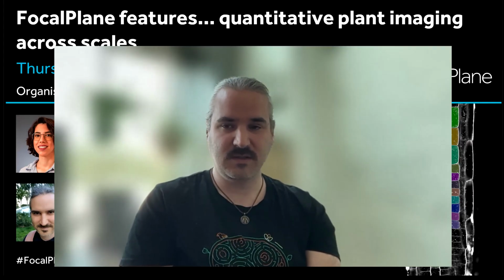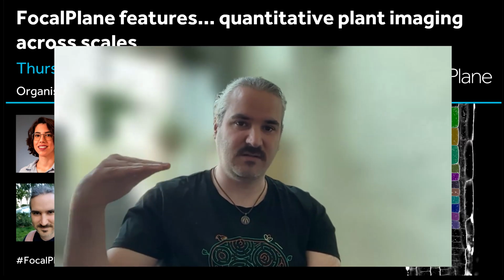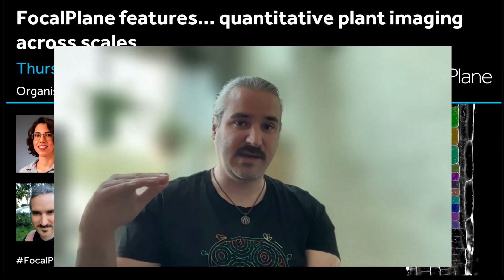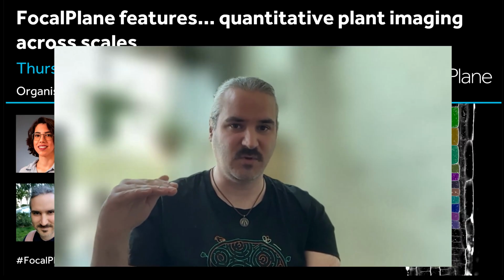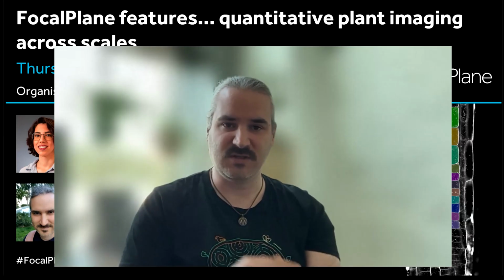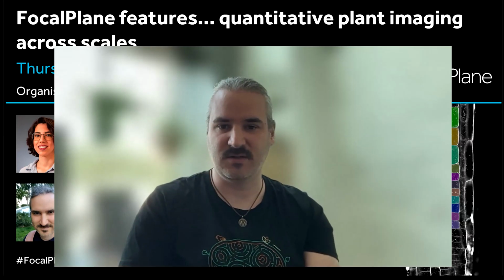However, there are tricks. You can actually section the gel as you would section fixed and embedded tissue after expansion. You just put it on a vibratome and you slice your gel. And then you can just image the slices individually and reconstruct it later.